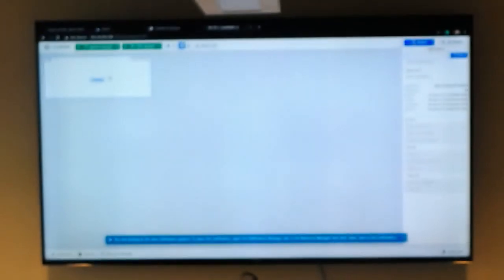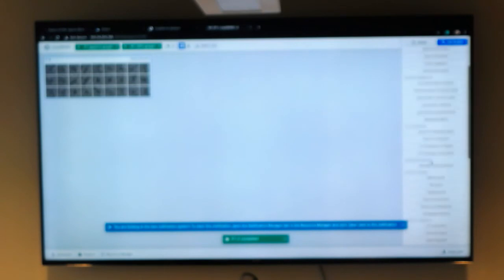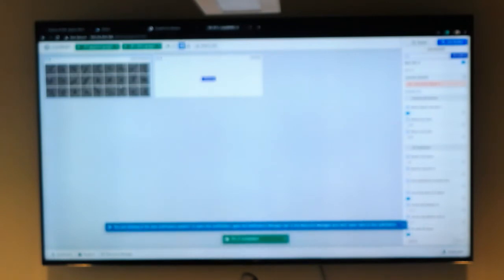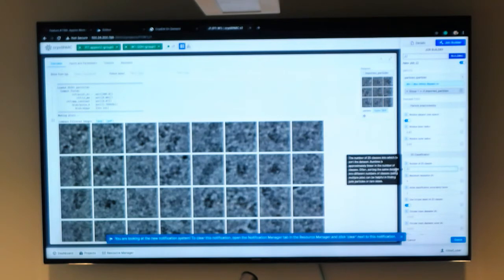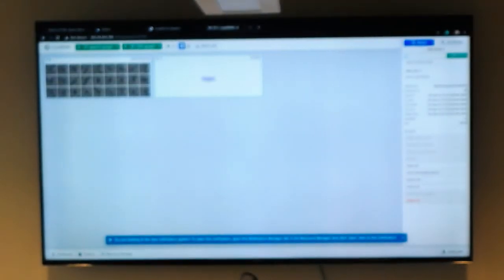So let's say you have a particular job that's running, you can select it and hit spacebar, and this window will pop up, right? And you are creating a job, and let's say I want to do a 2D classification job, and I want to get particles. This is very much click and drag. If I select this, hit spacebar, I see particles, I want these particles here, and for efficiency, I might not do all 50 classes, I might do a lot fewer. And then if I accidentally hit cancel, like oops, what happened? I want to build that job. I don't want to keep on doing that.